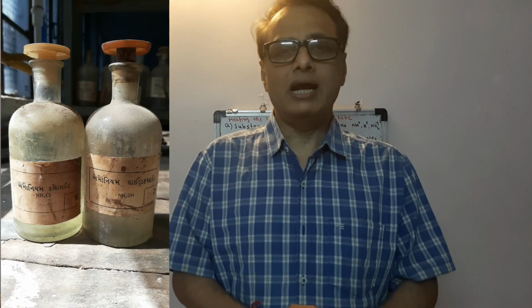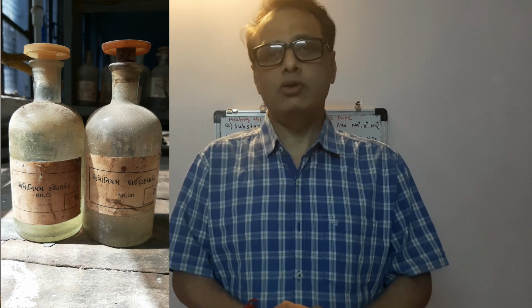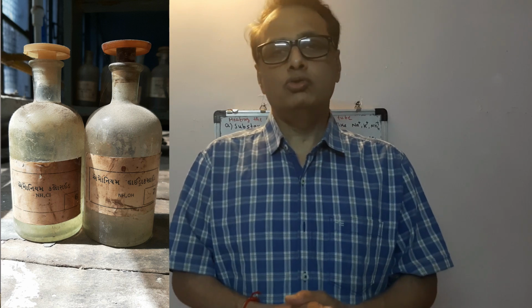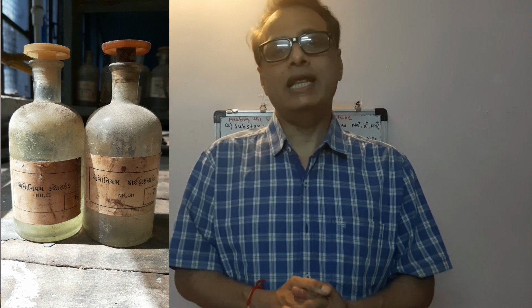Suppose if we don't get precipitates in the second group, then we should go for the third group. For that, ammonium chloride and ammonium hydroxide are the group reagent for the third A group. Third group can be classified into two types, third A group and third B group. So we have to take original solution and add NH4Cl and NH4OH.